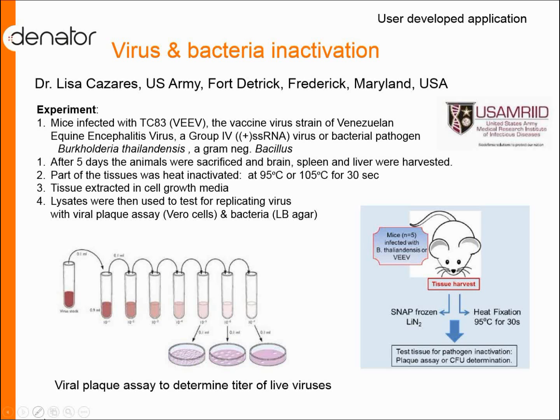So she wanted to use the stabilizer to quickly inactivate not only the enzymes but also bacteria and viruses, in order to render these samples non-infective and to speed up the process of removing these samples from these high containment labs out to the lab where she has her mass spectrometer.